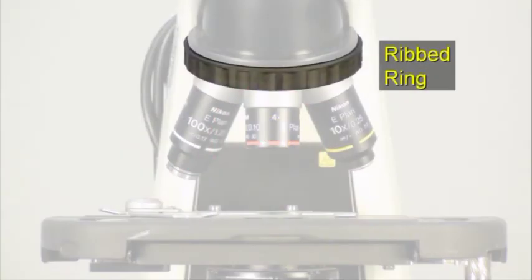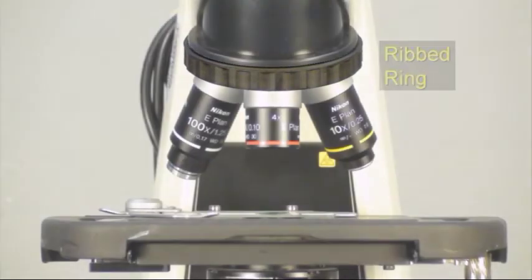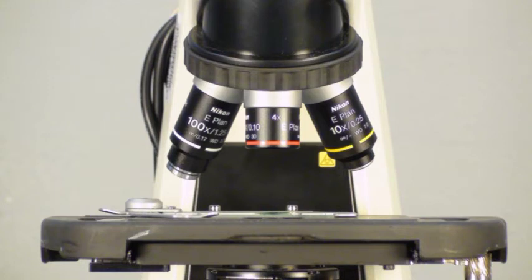The ribbed ring at the top is used to rotate the nose piece from one objective to the next. Each objective has a magnification stamp and a color-coded band for quick visual reference.